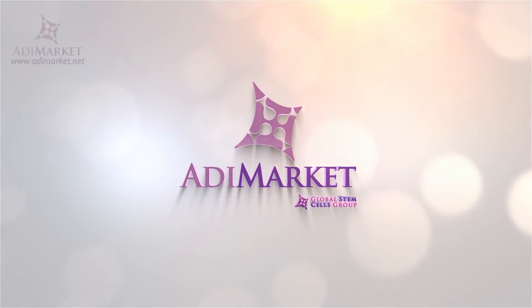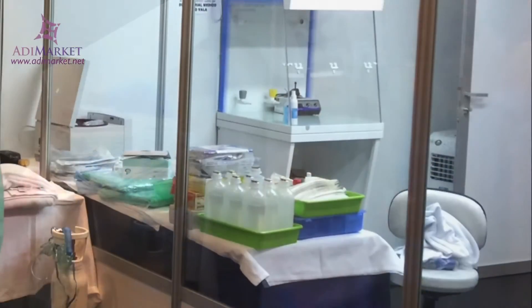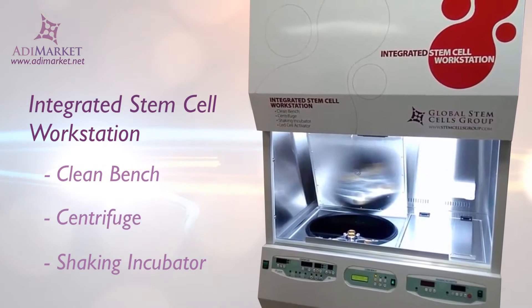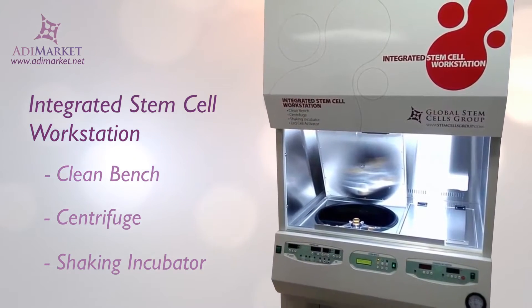Isolating stem cells requires a clean environment. Without it, you'll risk losing a sample, contaminating your laboratory, or worse. With our integrated stem cell workstation, you get the space you need to isolate stem cells or handle cells with the peace of mind that you're working in a safe environment.